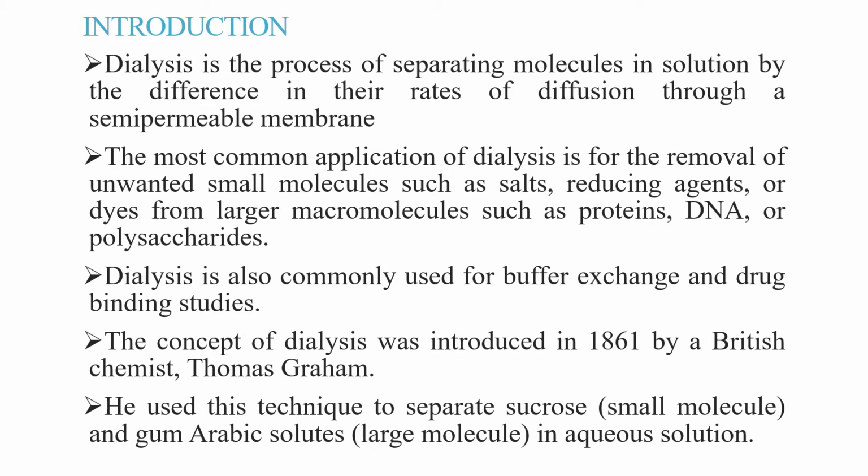The most common application of dialysis is the removal of unwanted small molecules such as salt, reducing agent or dye from larger macromolecules like proteins, DNA or polysaccharides. Dialysis is also commonly used for buffer exchange and in drug binding studies.